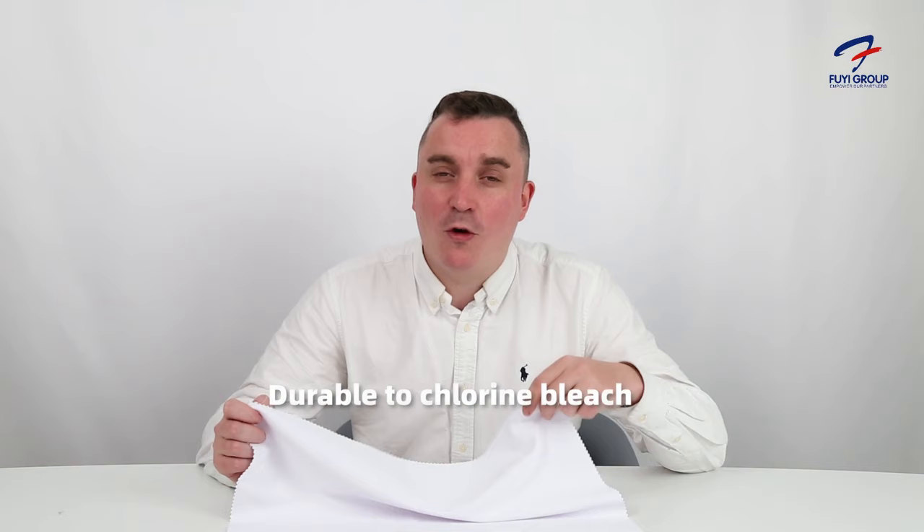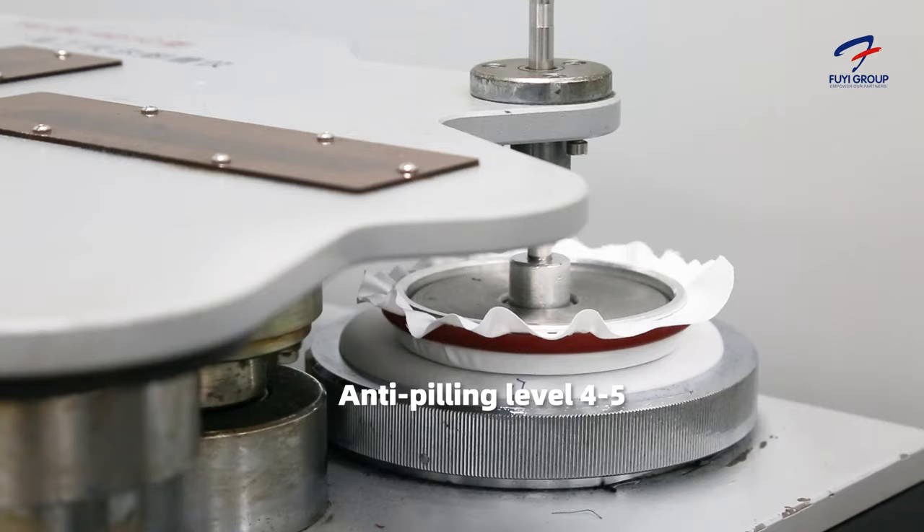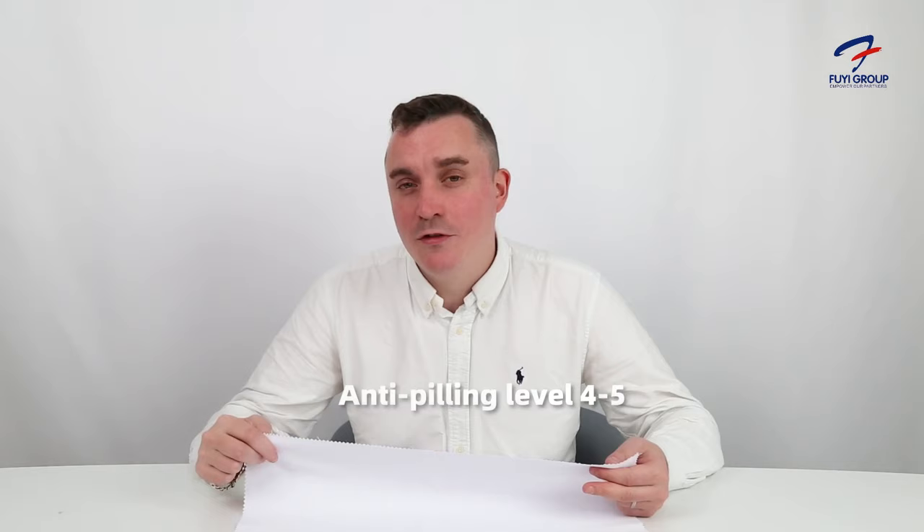Firstly, it's water repellent, which is very important. Secondly, it's durable to bleach chlorine or bleach washing. It's also antibacterial and can go 50 domestic washes without any of the colour leaving or any other colours attaching to it.